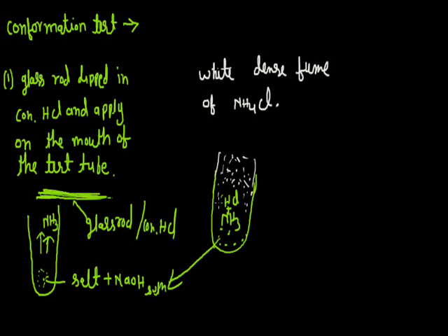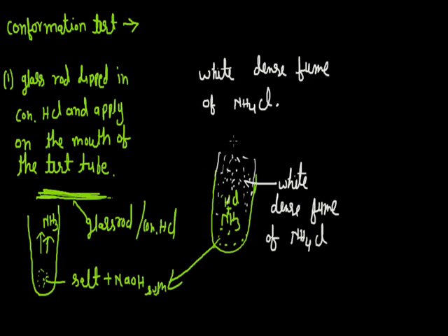These fumes are the white dense fumes of NH4Cl. So we can say that the ammonium, NH4 plus, is confirmed.